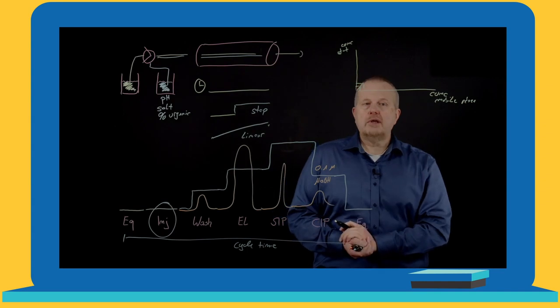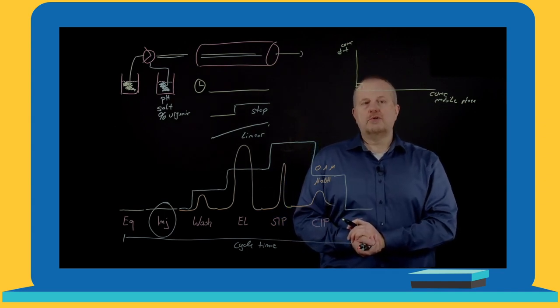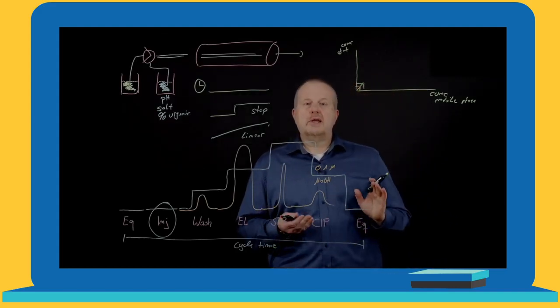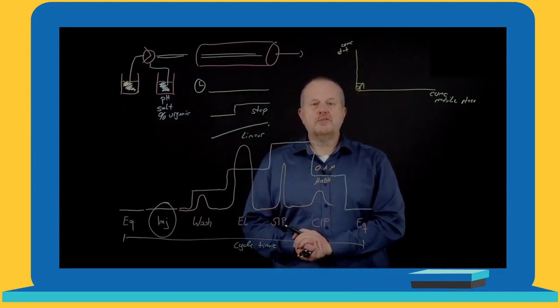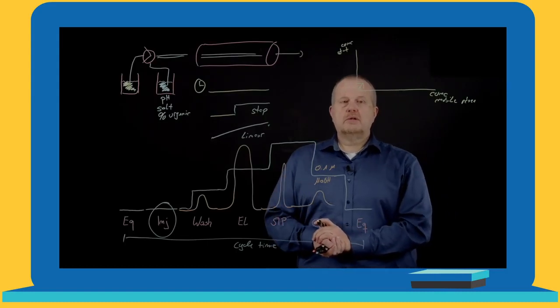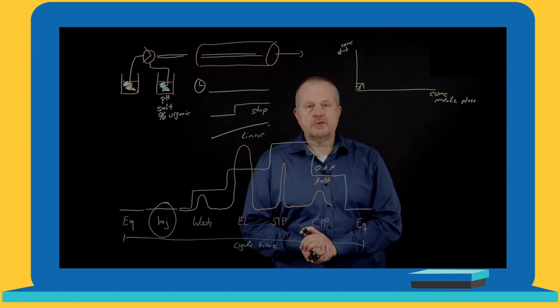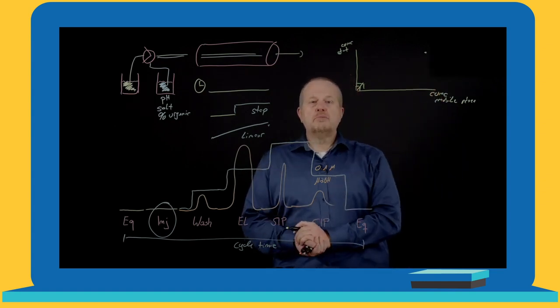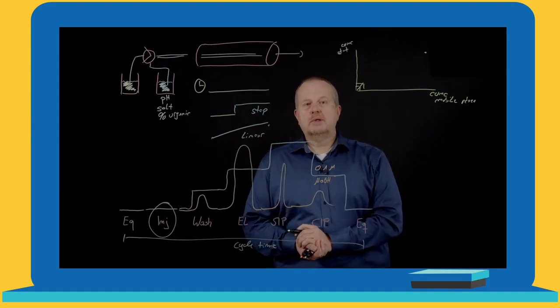And this is the area where all the analytical chromatography has to work, because otherwise you don't have a linear relationship and you cannot quantify what is in your mixture to be separated. But in preparative chromatography, we want to work up here. Maximum loading on our column.